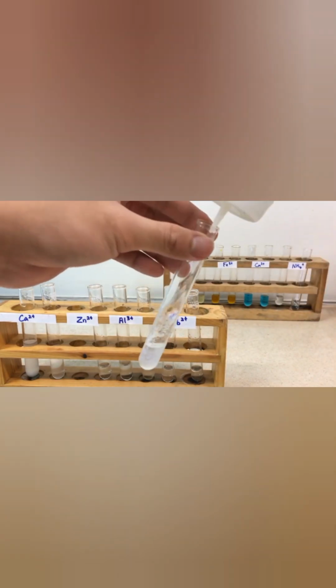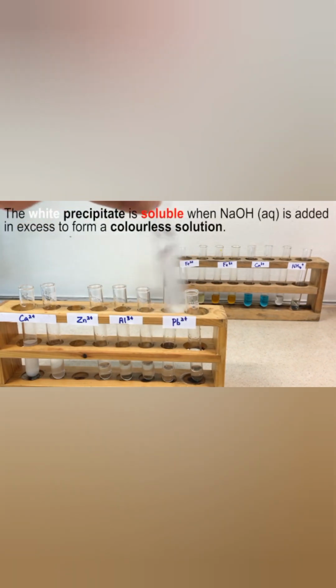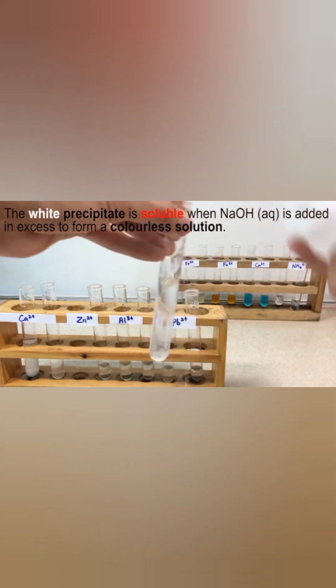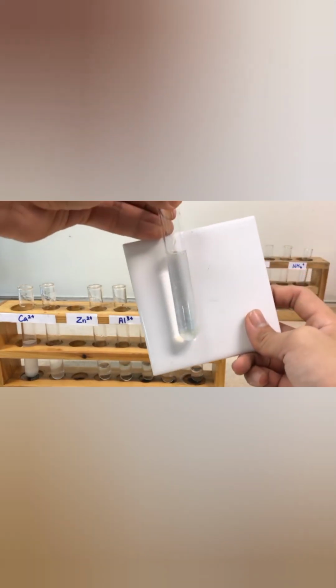Now, adding sodium hydroxide in excess, remember to always stir continuously. If you add it in excess, the white precipitate becomes soluble. The white precipitate dissolves in excess sodium hydroxide.